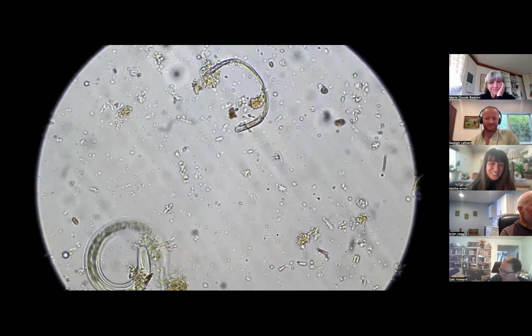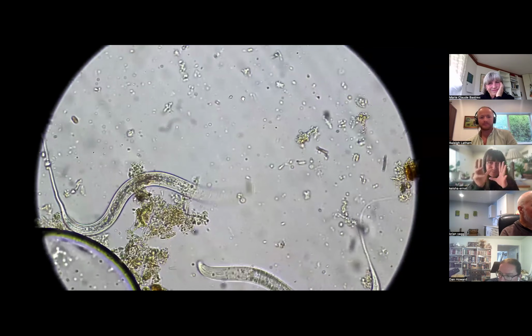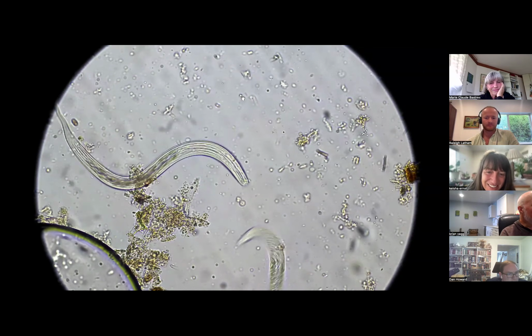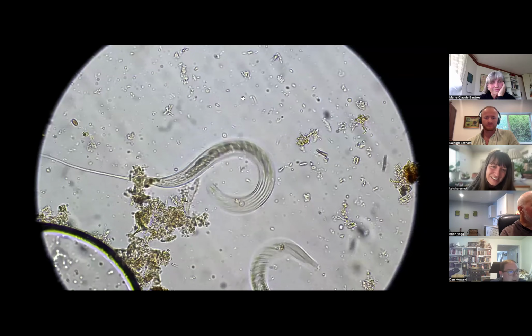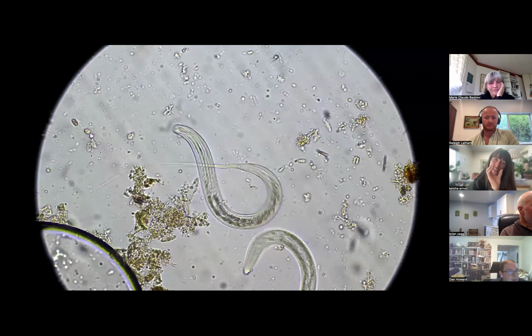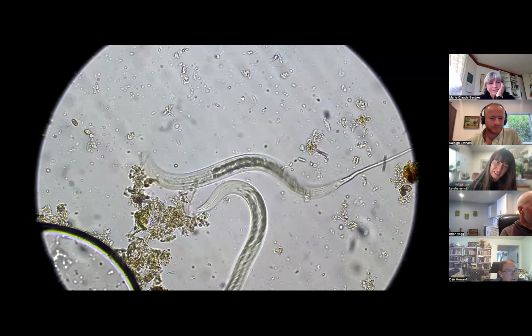It definitely is. You couldn't tell by the mouth part though. It looked pretty big, but kind of like this one, right? The mouth part's hard to look at. It also keeps coming directly towards the camera, so you're looking at its mouth wide open from the opening.